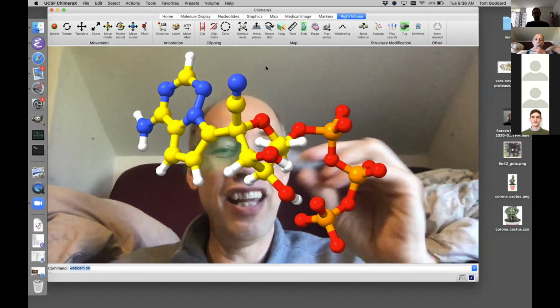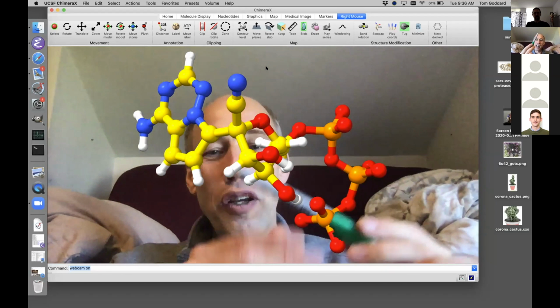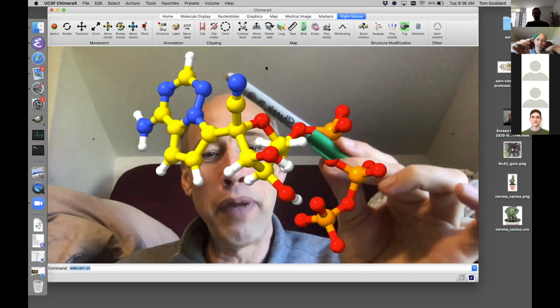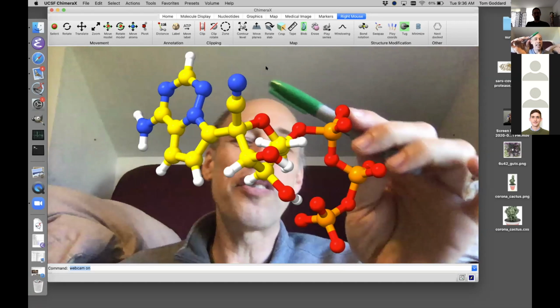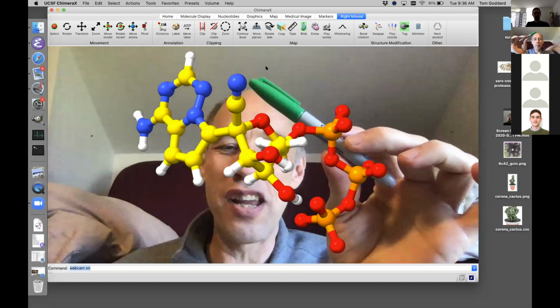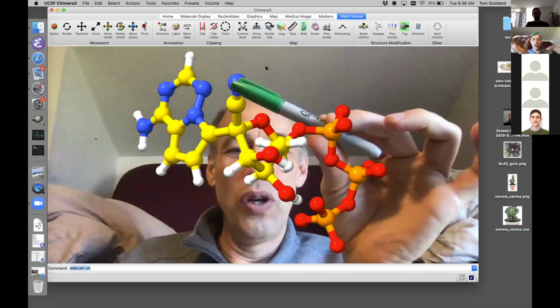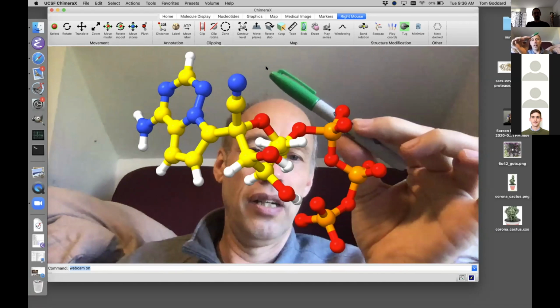Okay, look, the gray end of my pen is behind, but the green is in front. You can change this color green. Green seems to be a pretty good color in my tests. I guess I don't have very much green in my home and in my background of this video. And so green works well, but you could change it to blue or some other color as the color that gets put in front.